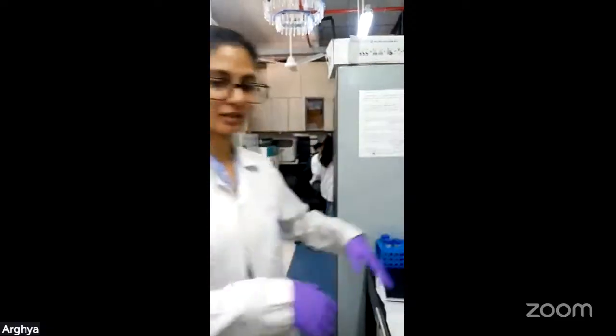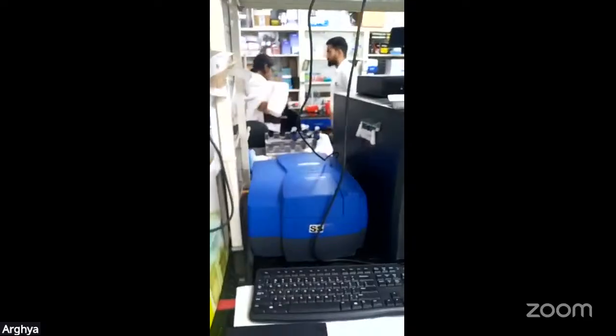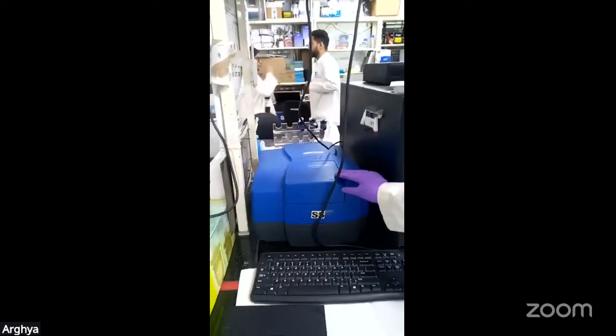So hello everyone, my name is Vaishali. And today we are going to understand the basic concepts of microarray, and we will move specifically to protein microarrays. So this is the GenePix protein microarray scanner.